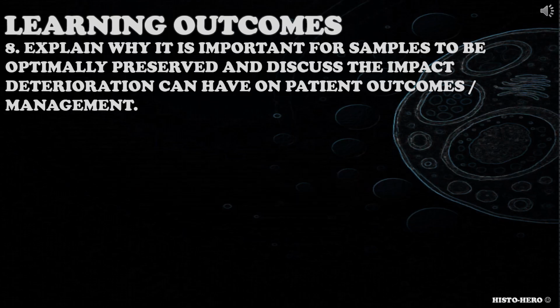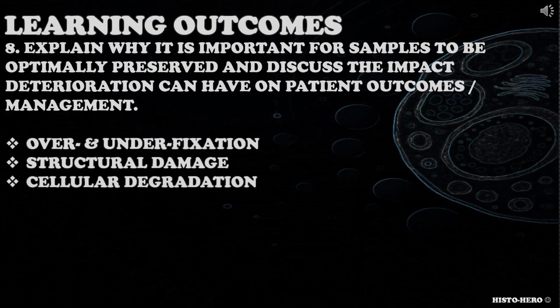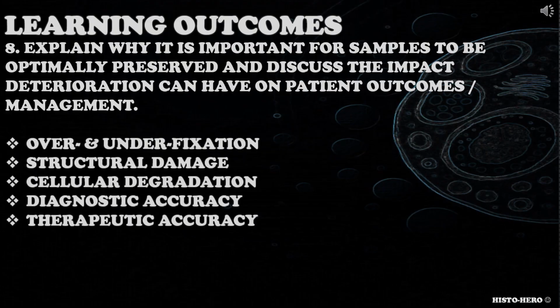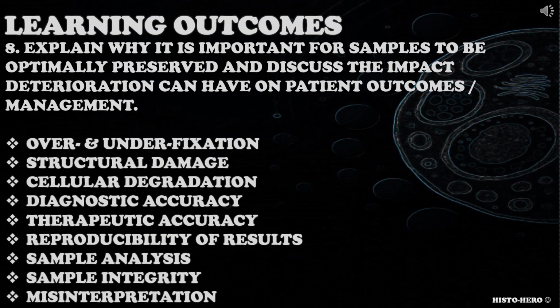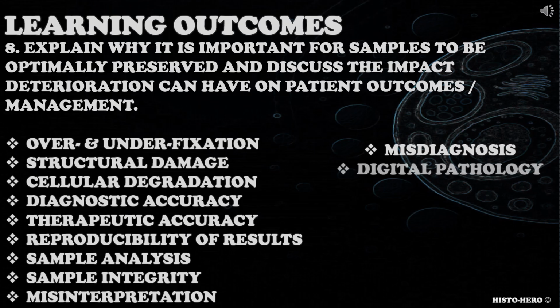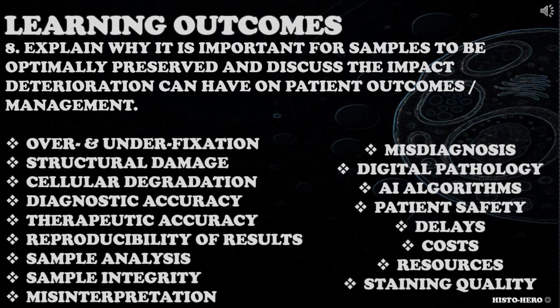Candidate could consider over and under fixation, structural damage, cellular degradation, and their effects on diagnostic and therapeutic accuracy, reproducibility of results, compromised sample analysis or integrity, misinterpretation or misdiagnosis, digital pathology and AI algorithms, patient safety, delays, costs, resources, affected staining quality and so on.